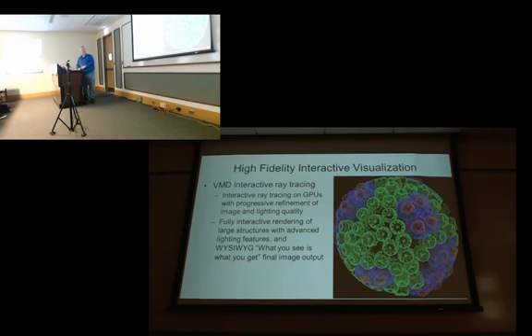I will say that for you to make these pre-renders and all these beautiful pictures that we do in VMD, I advise Linux platforms, because you have access to all these features, while on Mac and Windows, VMD itself is limited in what you can do with the renders. It takes a long time to develop the low-level technology that goes into this. I'm going to show you in the next few slides some of the advanced rendering features that are presently implemented only in Linux.